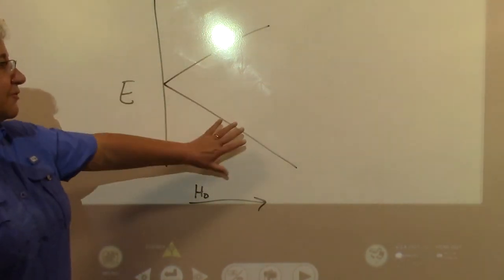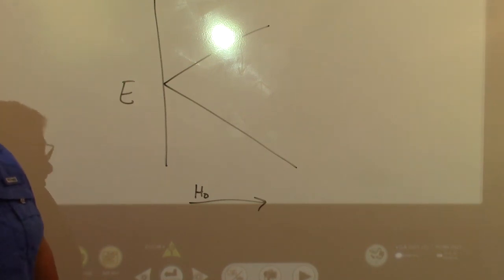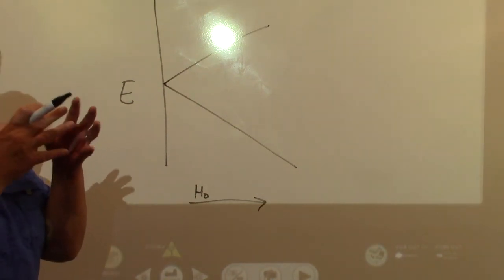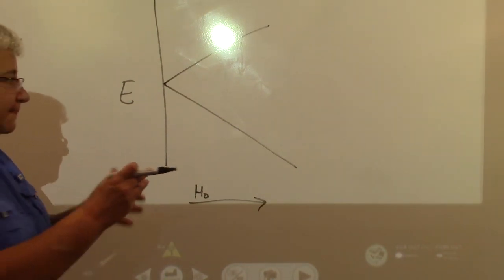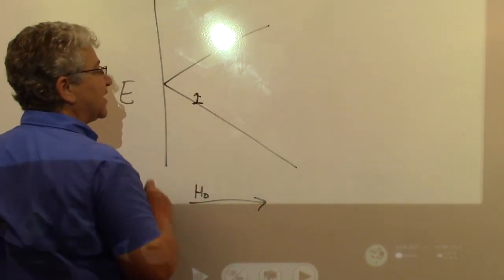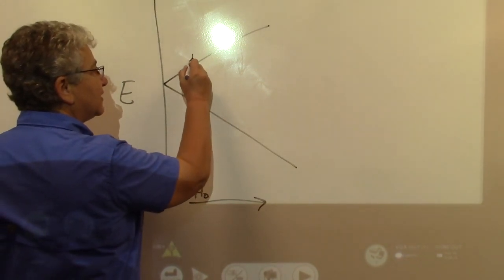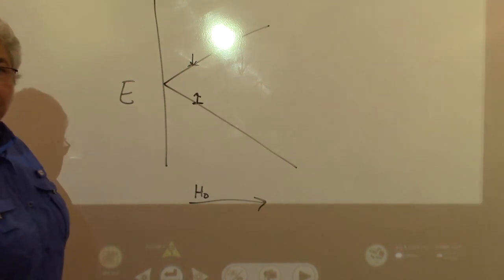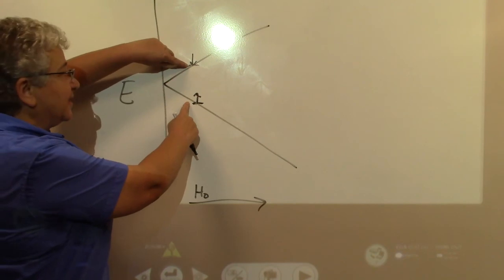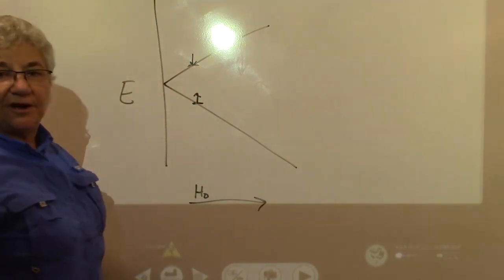What this diagram represents for you is not a K. What this diagram represents is that if I have a certain magnetic field that my atom is feeling, then there's an energy difference between the nuclei that line up with the field and the nuclei that line up against the field. So this is a set energy gap.